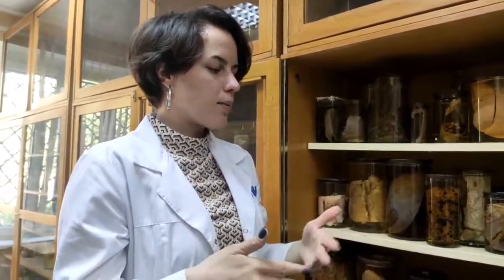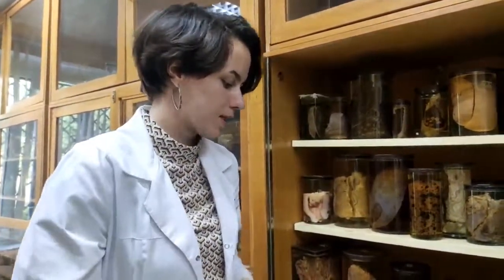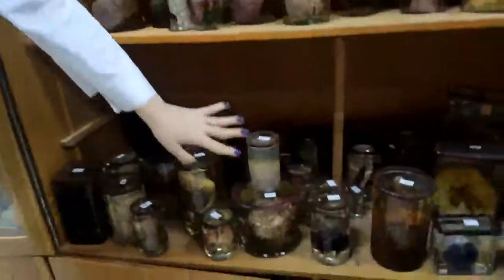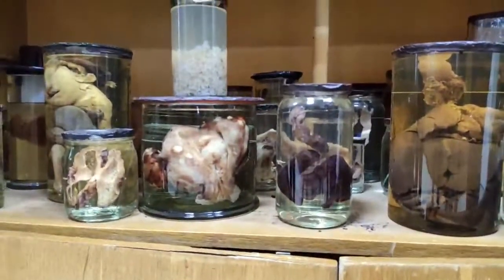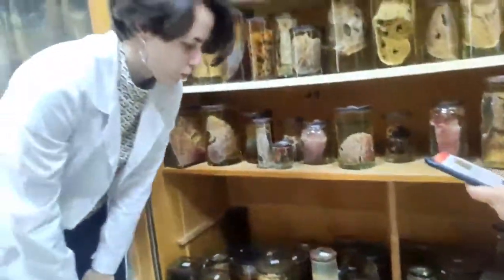I mean, for example, this woman can't become pregnant, or it brings a lot of pain to her. So sometimes they are removed surgically, but not because they become malignant tumors, just because they cause a lot of problems in the patient. But if they are single tumors, it's not a problem for women at all.